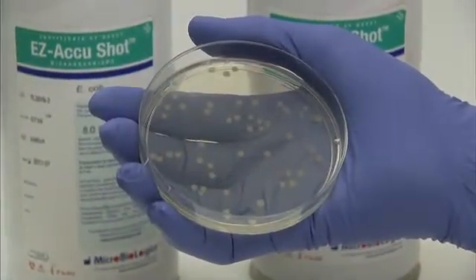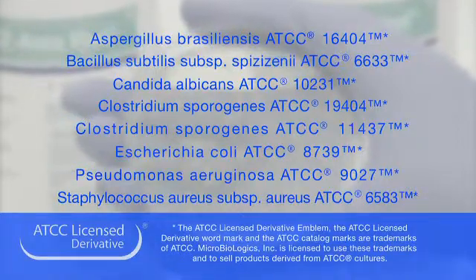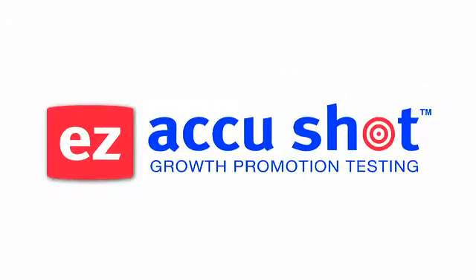After incubation, count the colonies. Easy AccuShot is available in 8 microorganism strains. For precision made simple, rely on Easy AccuShot.